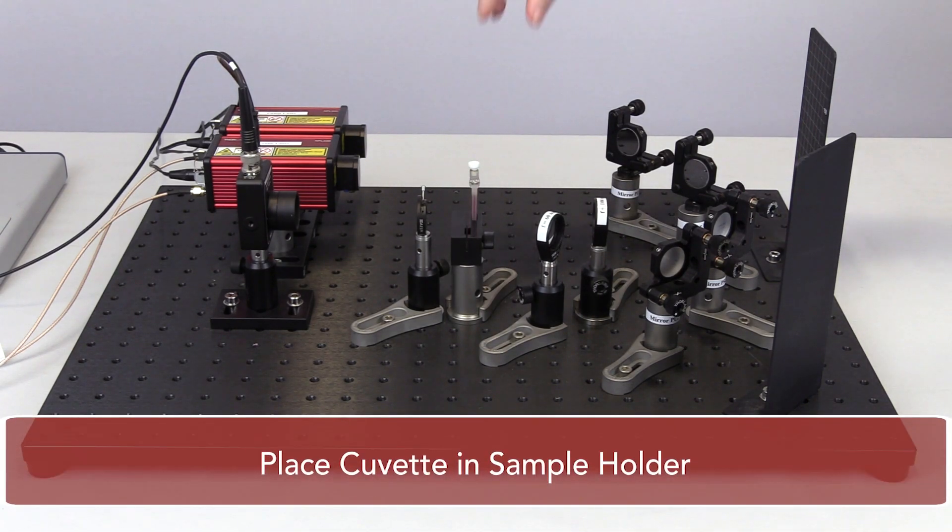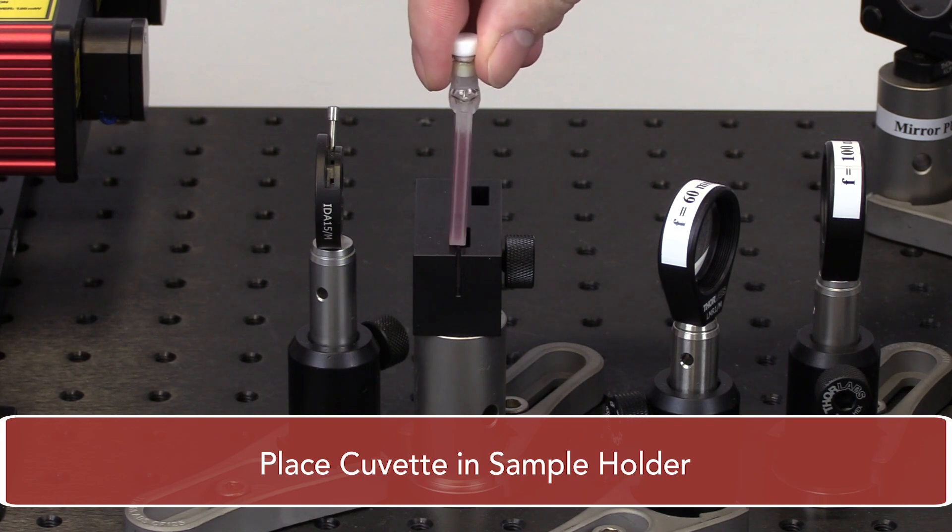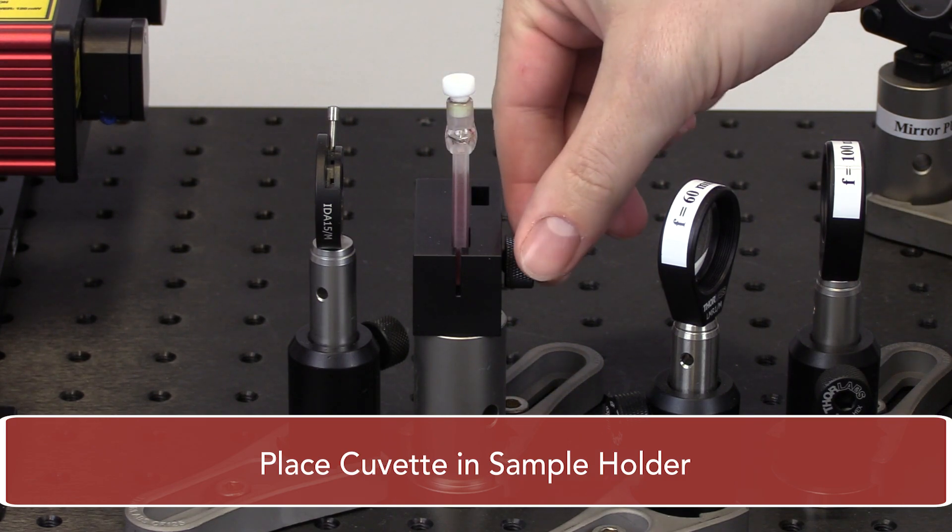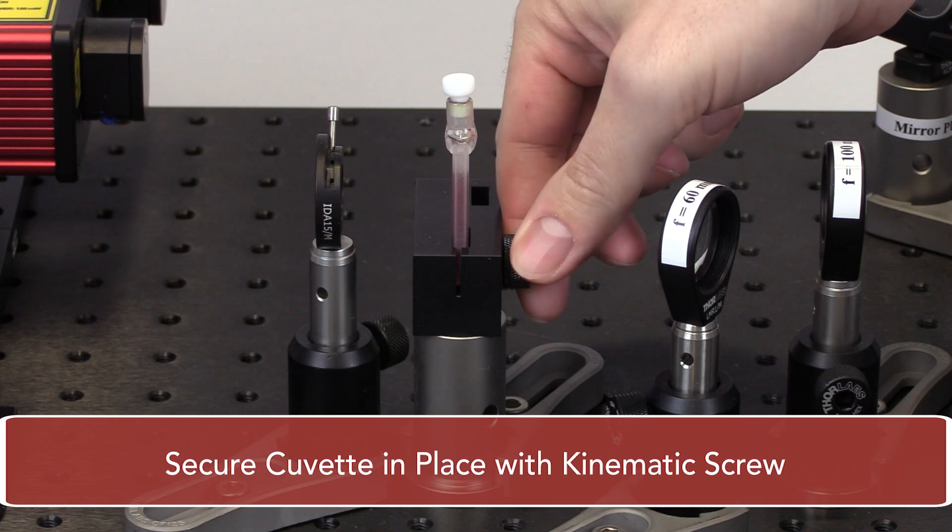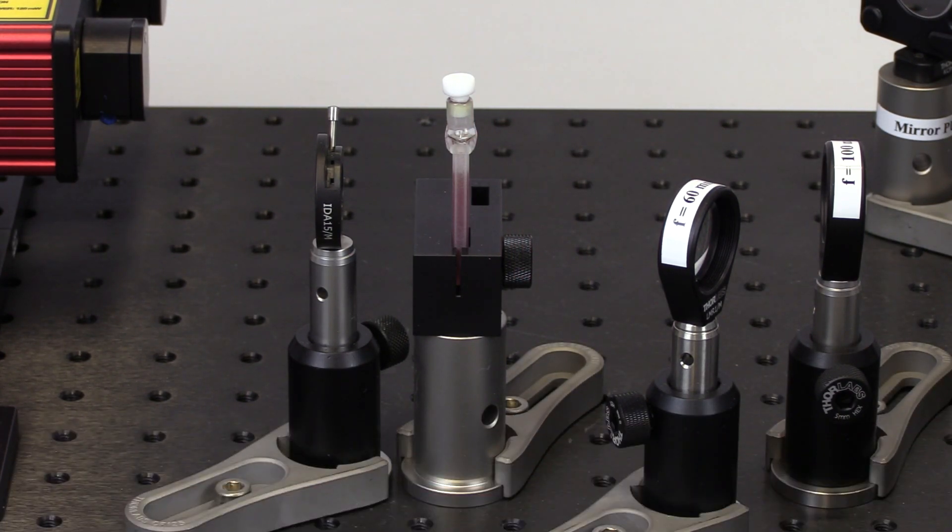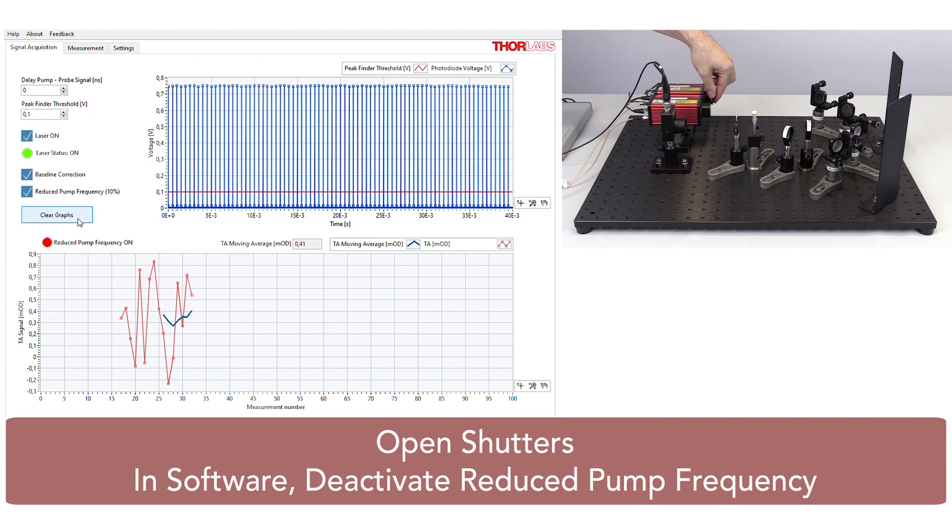Then, place the cuvette into the slot of the sample holder that sits in the beam path. Rotate the locking screw to secure the cuvette into place. Open the laser shutters.